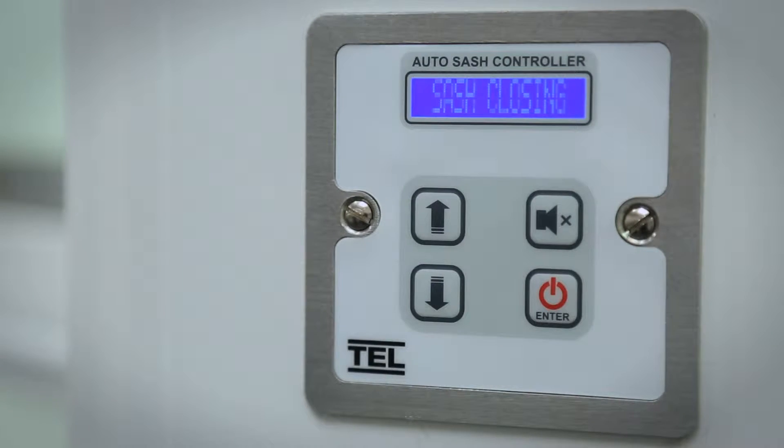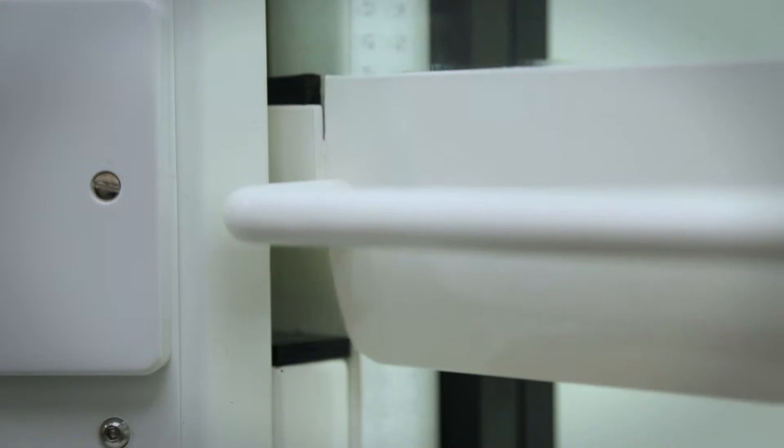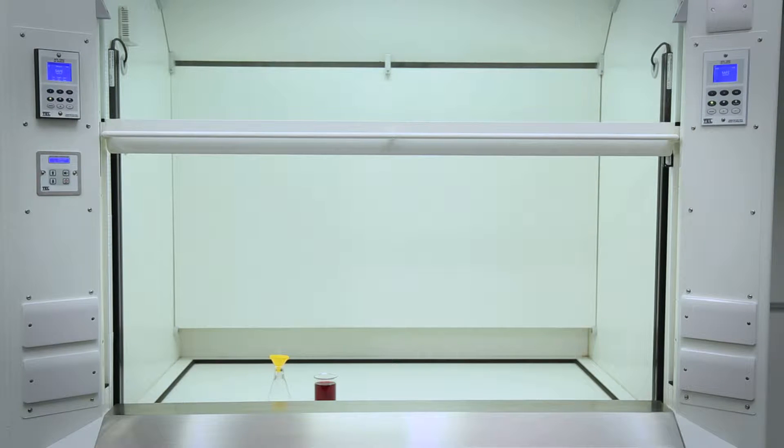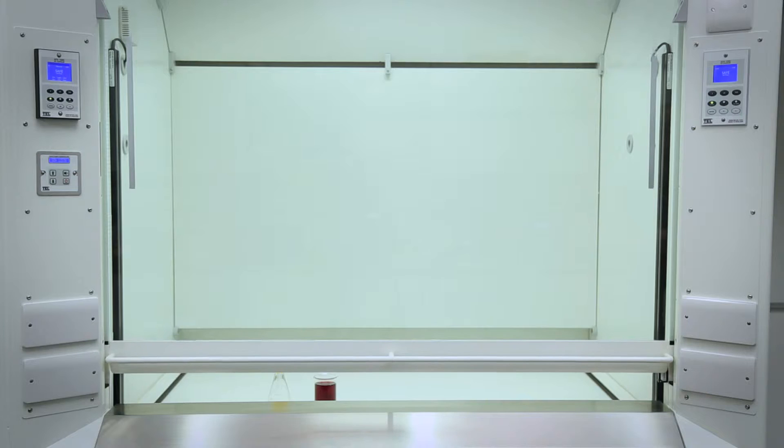We've specifically designed our auto sash controller to close the sash automatically when the operator is not present in front of the fume hood. If no movement is detected and the sash opening is clear, the sash will automatically close after a predetermined, fully adjustable time.